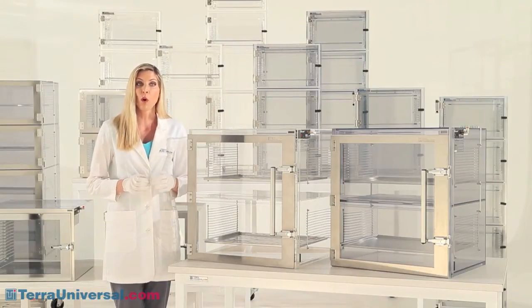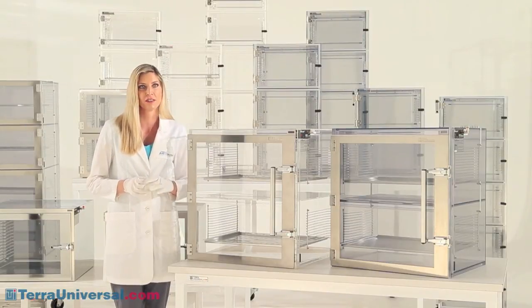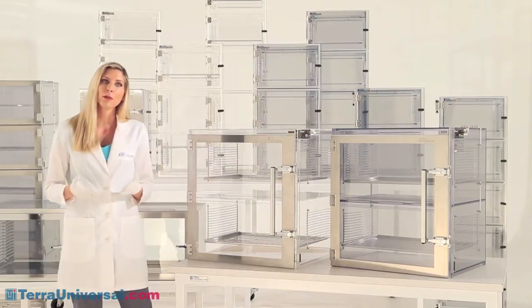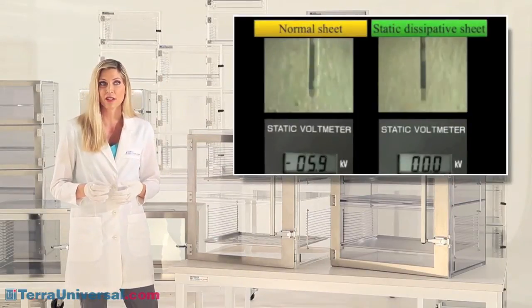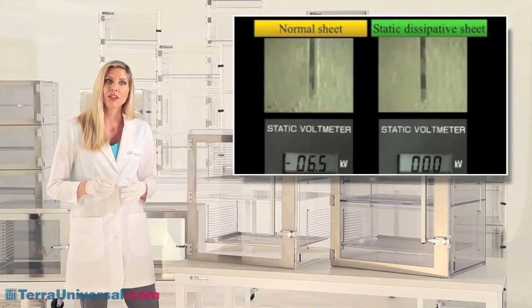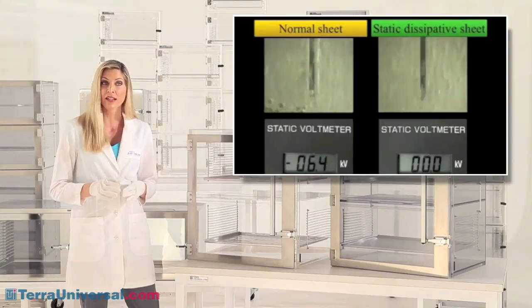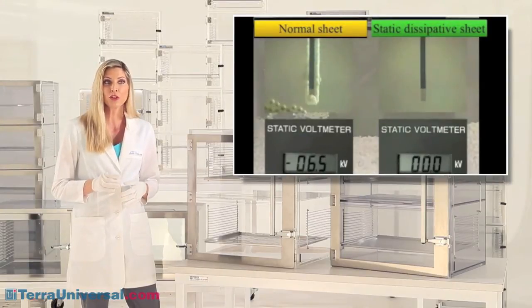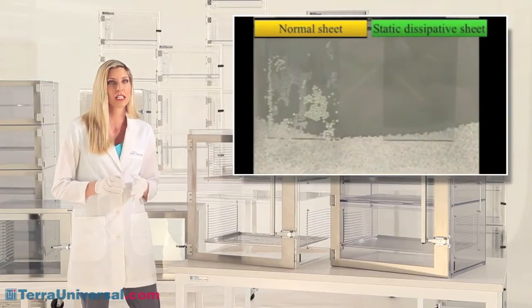After repeated wipe-down with alcohol or other cleaners, you'll see the material begin to show small cracks or discoloration. Another problem with acrylic is that it allows generation and accumulation of surface charges. When you wipe down an acrylic surface, you create these charges, which can cause two problems: they can discharge onto static-sensitive parts, and they also attract and hold tiny particles, making an acrylic desiccator hard to clean.